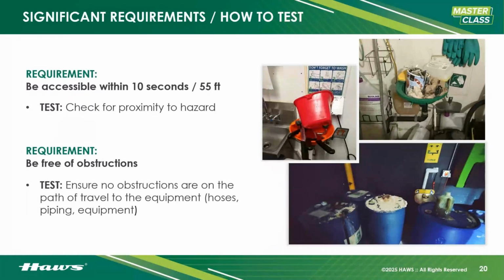Anything that is going to take time for us to navigate, remove, etc., out of the way so that we can utilize the eye wash or eye face wash, we're in trouble. We will have to avoid any obstructions preventing us from using the equipment in a timely manner. Okay, and incredibly important. So watch for obstructions. Keep it within 55 feet, 10 seconds.